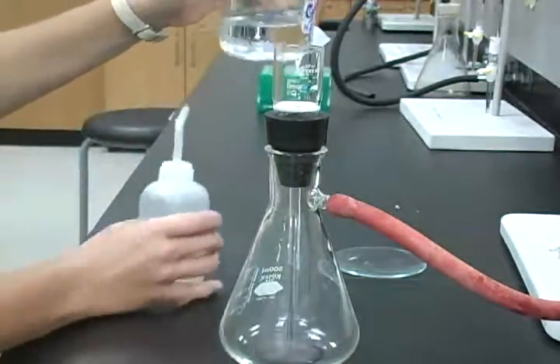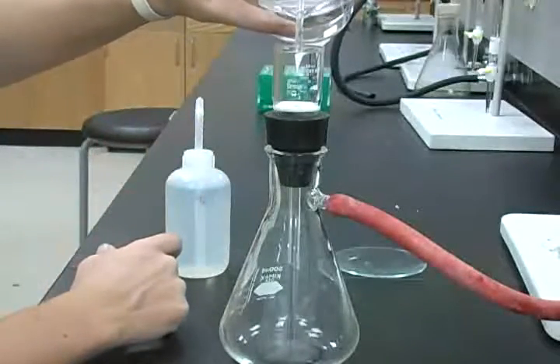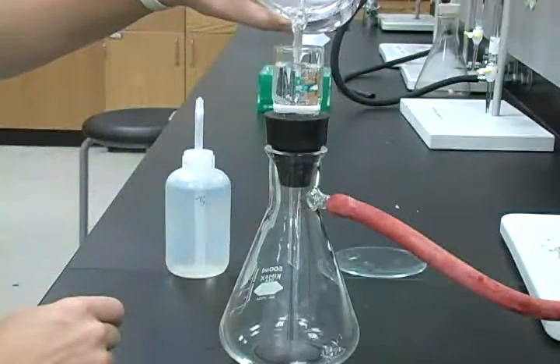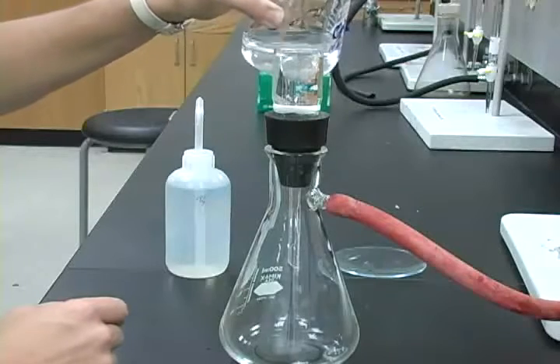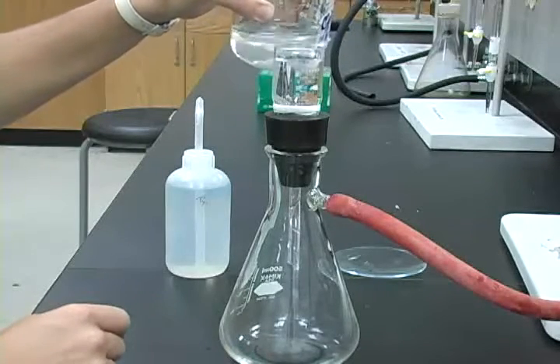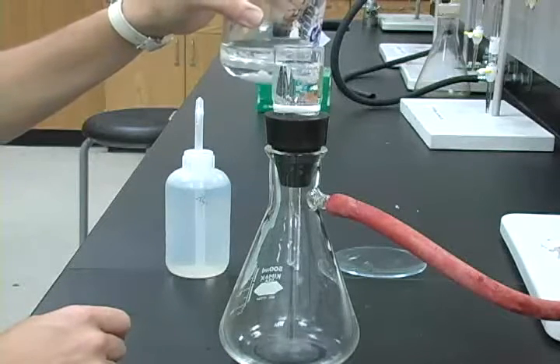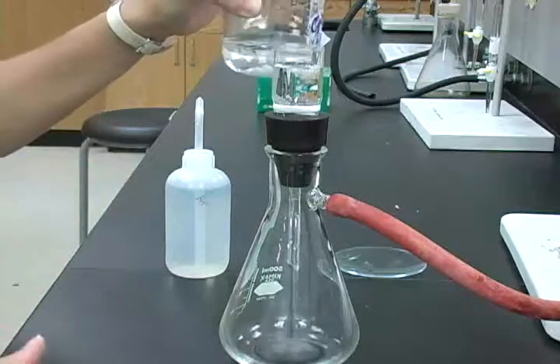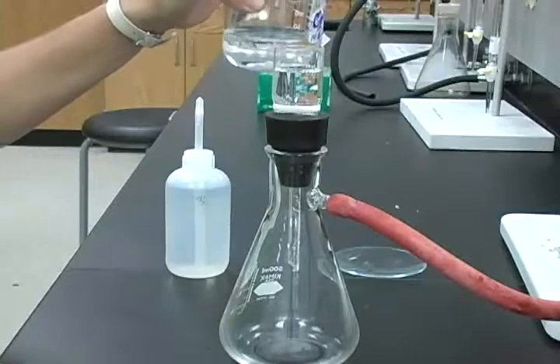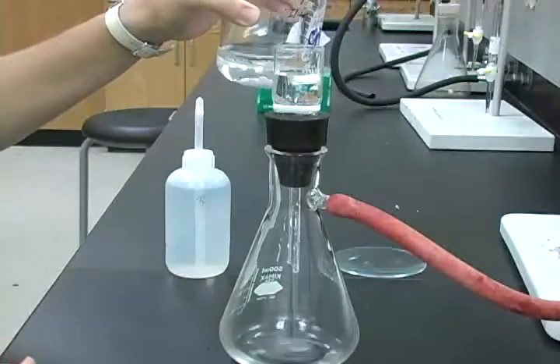The filtering of the precipitate begins first by decanting the supernatant layer, using the stirring rod to pour the liquid over. Pay attention to the filtrate and make sure that the filtrate still remains clear. Cloudy filtrate is an indication of possible peptization, the coagulated solid reverting back to the colloidal solid. If that is noticed, make observations in your notebook about that occurrence.